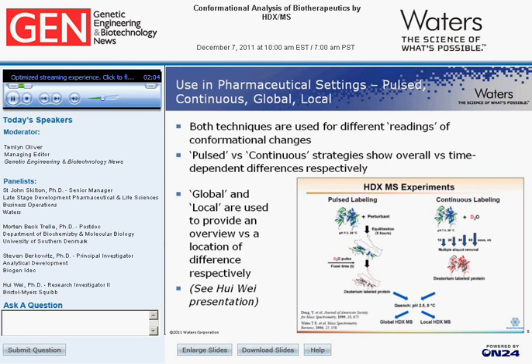So pulsed, of course, looks at some kind of perturbation, some gross perturbation to see what happens when you do that, and the effect then on the uptake of deuterium, from which you can infer just how bad the change in conformation is, or how gross it is. And then continuous labeling looks at generally time courses, and this is the high-definition version where you can make dynamic comparisons.